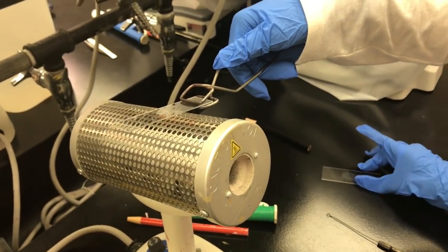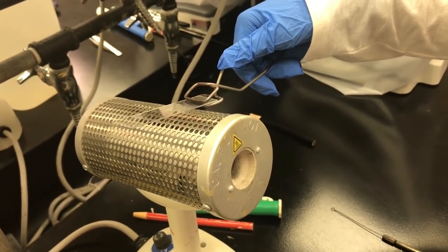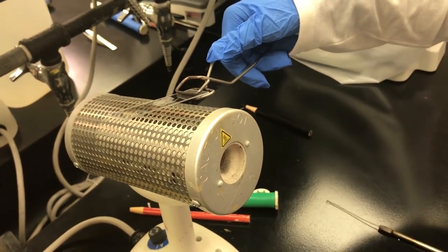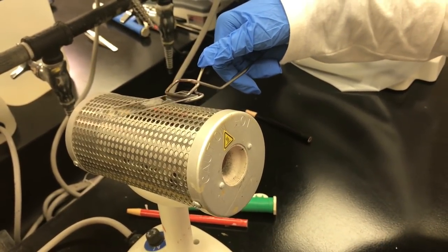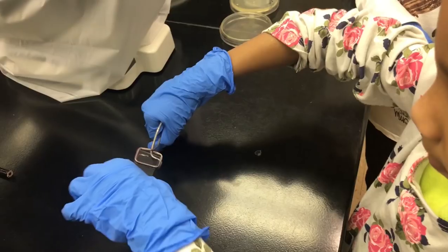What this step is called is heat fixing. So you're killing the bacteria, and you're forcing the proteins of the bacteria to stick to the slide. Is this so when you stain it, it doesn't wash off? Is that why it's called the bacti-cinerator?